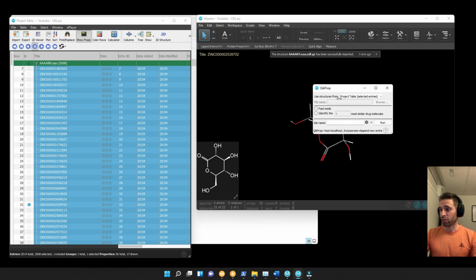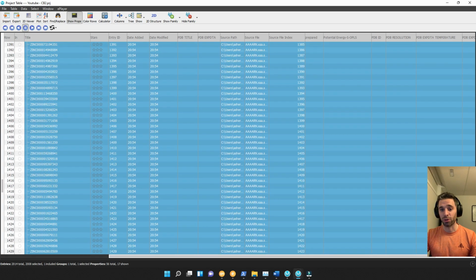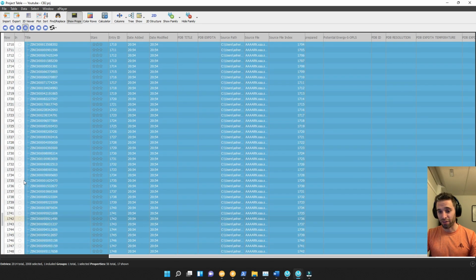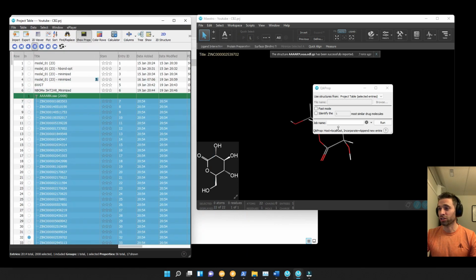We're going to make sure that we have use structures from project table selected entries. Let's make sure we only have selected entries that we want. We don't want to have our ligand selected, so we just want to have these 2000 entries selected, which looks good. File name, job name.